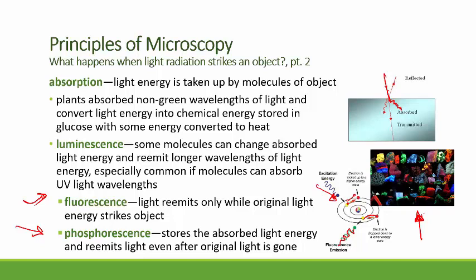I couldn't find any good images of a before, like invisible light, and then under UV light, the phosphorescence. But you can see how many of the minerals in the picture there are glowing back a green or a yellow or a red or even kind of a neon-y looking blue color.